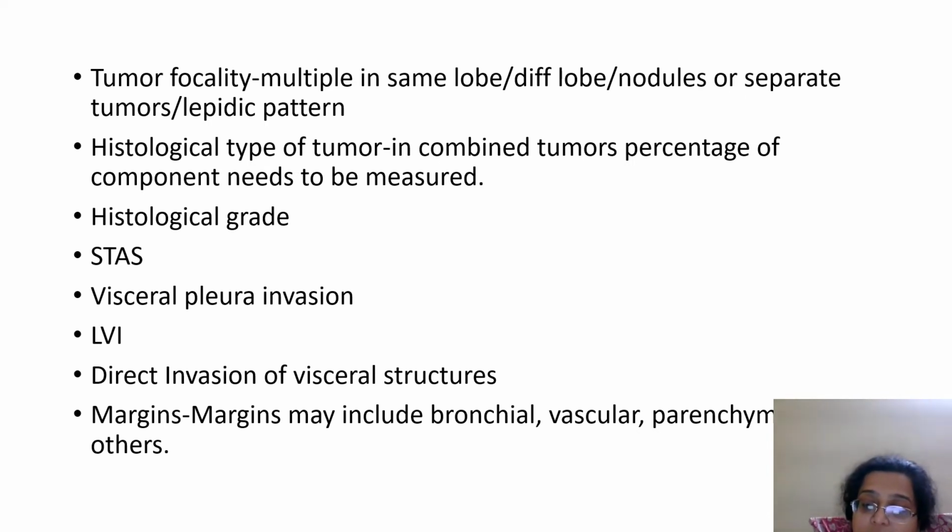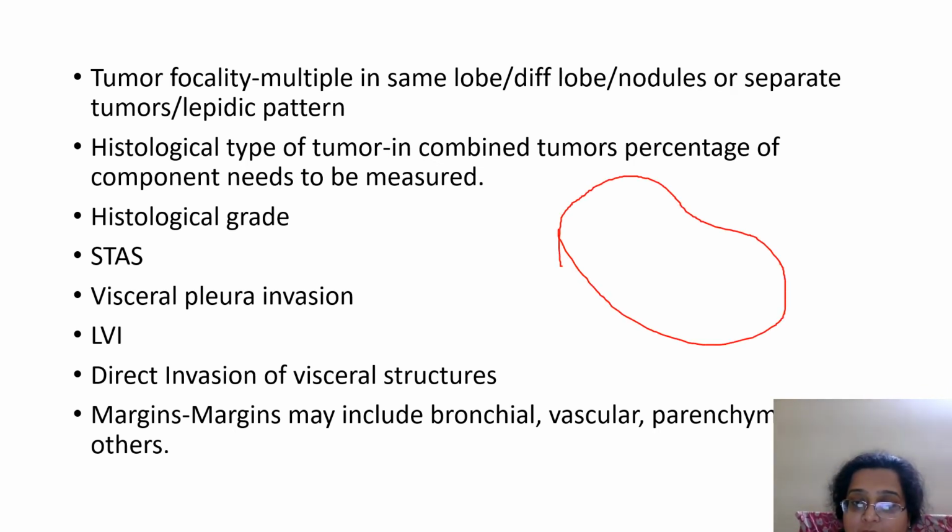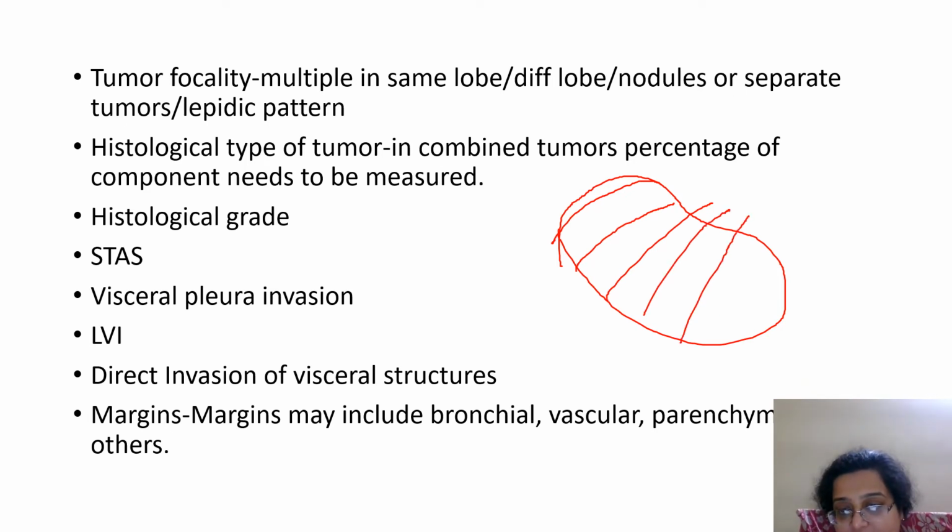Then once we have taken our section, so once you cut the lung, after noting these points down and observing them, what I do is I normally lobe it at 1 centimeter, keeping the direction of the fissure in mind. Fine. So supposing this is a lobe of lung I've received and there was a fissure over here which I can make out, then I'll make incisions like this.